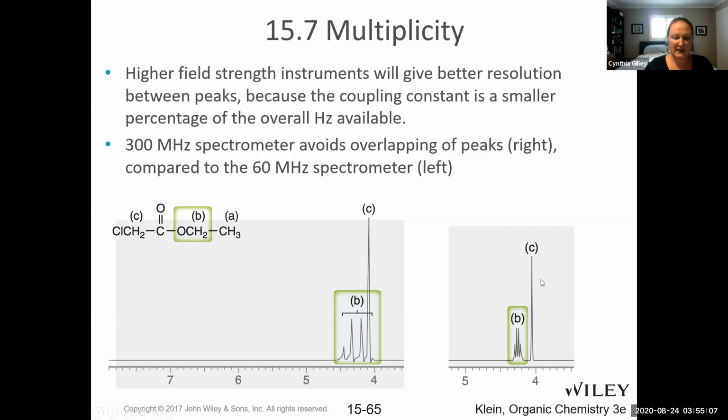The way I think of it is if you take, for example, the divisions between 4 and 5 on the x-axis, so in chemical shift or parts per million, you can break this up into 60 pieces if you're using a 60 megahertz NMR, and you can assign signals to those 60 pieces, right?